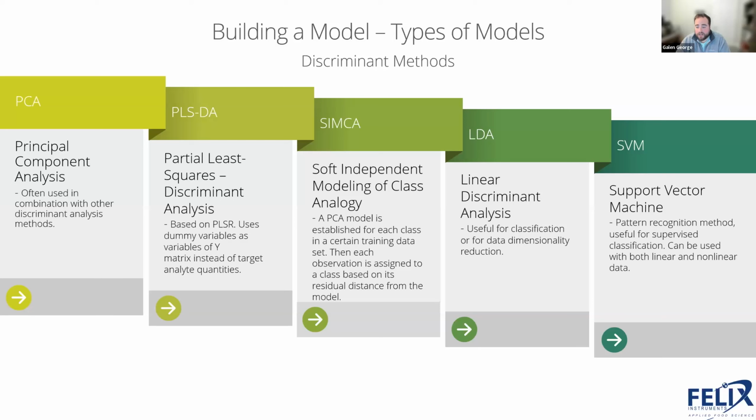But discriminant methods are definitely less common, I would say, in what we're trying to do than the actual quantitative calibration methods. And so this is really the more important part of this that I wanted to talk about.